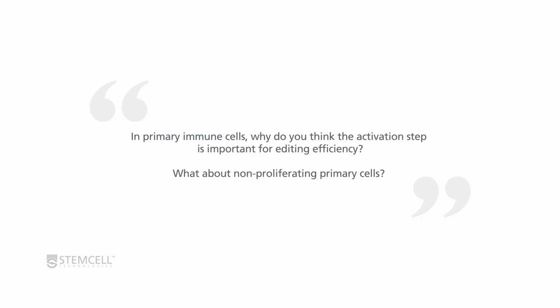And then on that vein, what about non-proliferating primary cells? Is activation sufficient, or is it really the proliferation of the cells that's needed? Well, I think in the field, it's believed that proliferation of the cells can at least enhance delivery. However, there is some indication in the literature that activation is not always necessary, especially in primary T cells, in order to obtain high efficiency editing. And it might actually be that you need to optimize your delivery parameters, so the electroporation conditions, in unactivated versus activated cells. That might help.